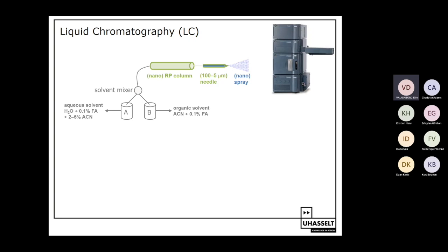It's oily, right? And before we start the experiment, we will put all our peptides on this nano reversed phase column. So all our peptides are on a silica bead column, and they are there dry and safe. We also have a needle, and I will talk about this needle later on, but it's not important now.